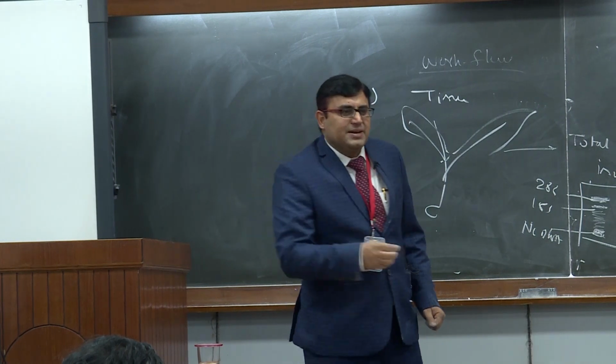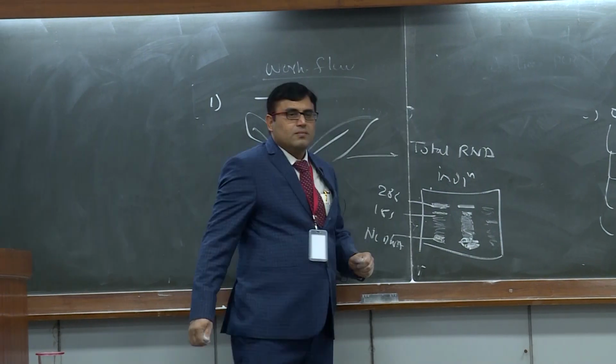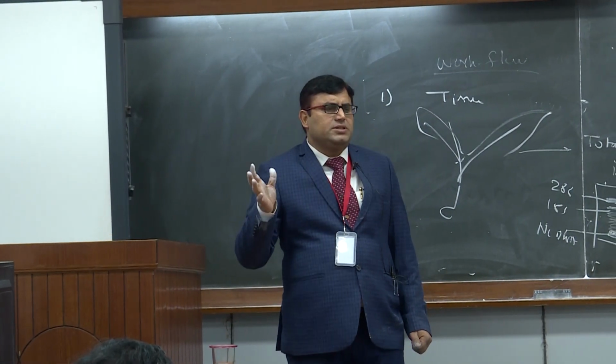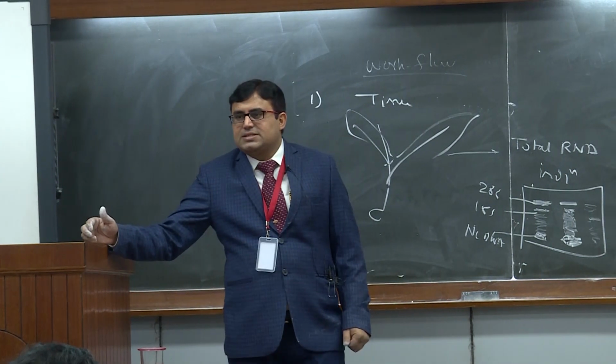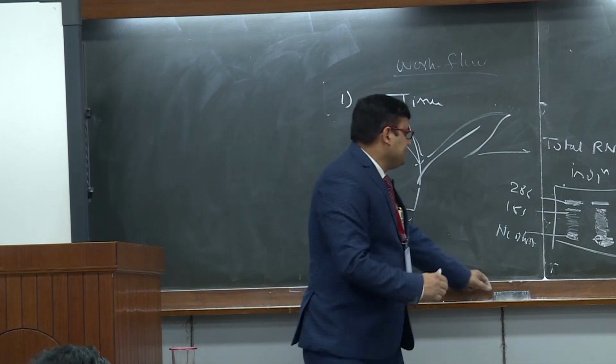If it is completely degraded, it will be something like this. It means the RNA which you have isolated is completely degraded, nothing is left over. And then you can validate this by using any of the techniques or the instruments which I have listed. Is it okay?